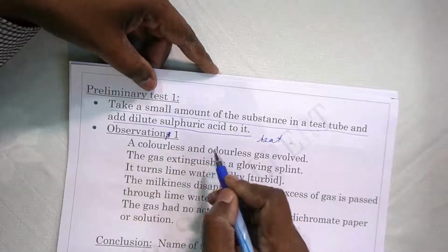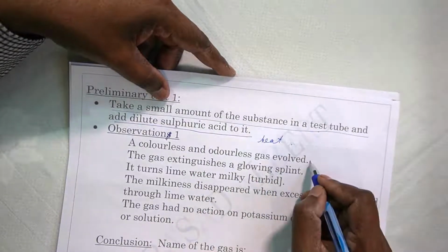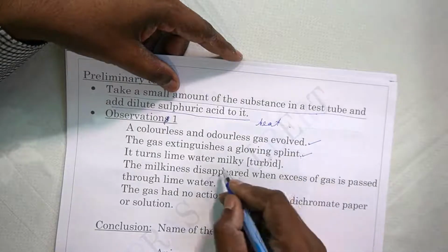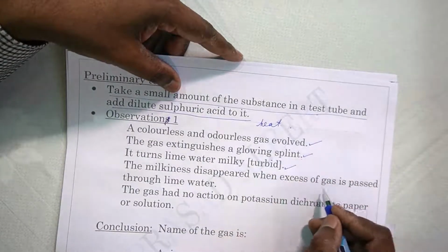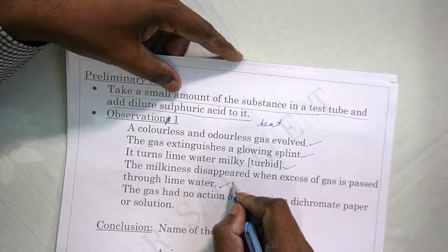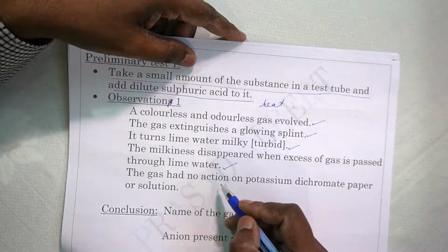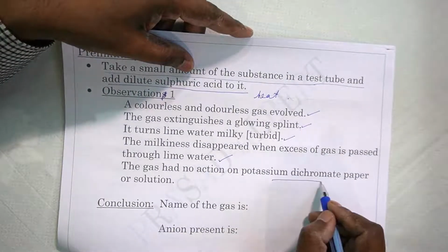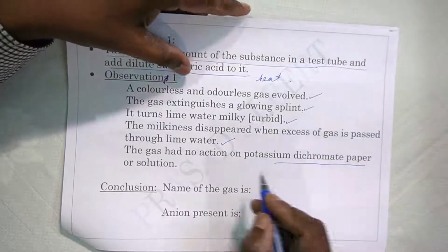Observation 1. The first observation is a colorless and odorless gas evolved. The gas extinguishes a glowing splint. The gas turns lime water turbid or milky, and the milkiness disappears when excess of the gas is passed through lime water. So these are the qualities of the gas: a colorless, odorless gas which gives these tests. And the gas has no action on potassium dichromate paper. If you dip a filter paper in potassium dichromate solution and introduce it to the gas, nothing happens.